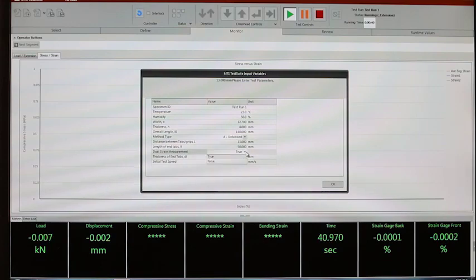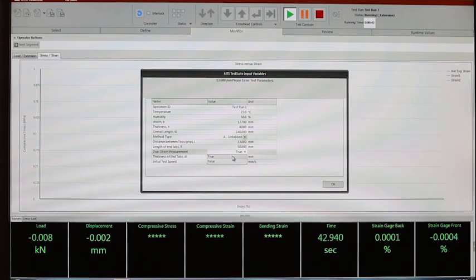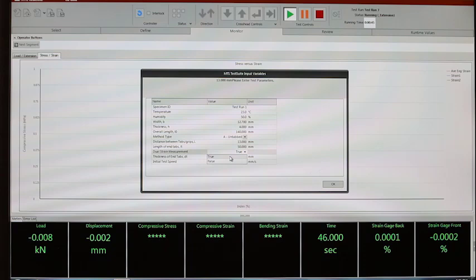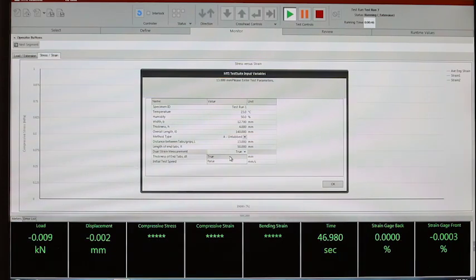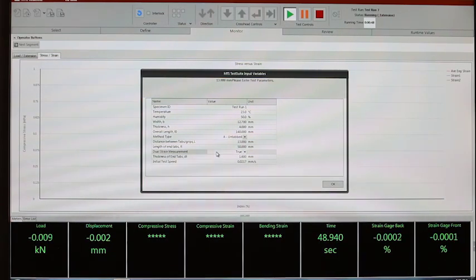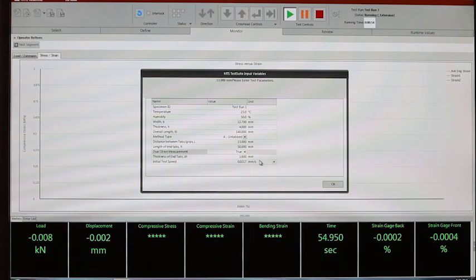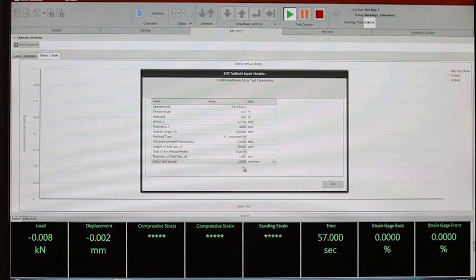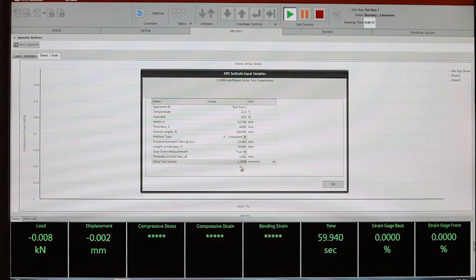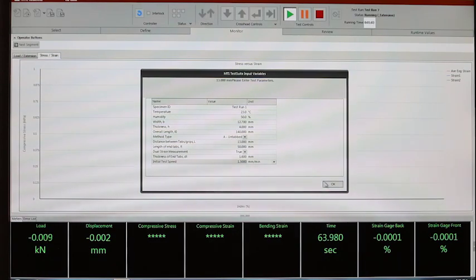We also support different types of strain measurement methods: dual strain measuring on both sides of the specimen, or only on one side. In our case, we measure on both sides of the specimen so that we can evaluate the bending strain throughout the test. The initial test speed is set by default to the value recommended by the ASTM D6641 standard: 1.3 mm per minute.